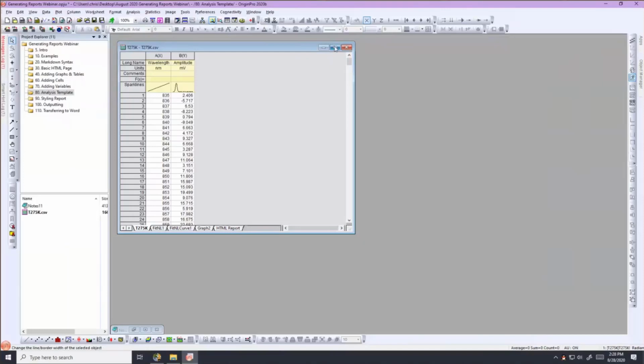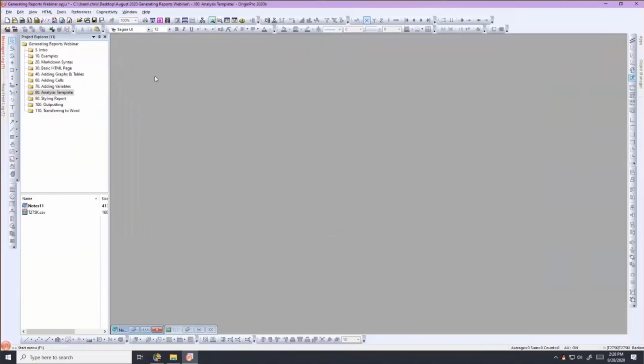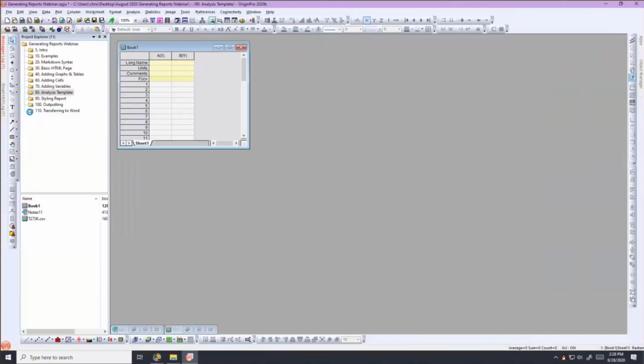So maybe a week later, we get some data files we generated. We'll come in and choose File. I need to actually activate a workbook for the menu to show up properly. We'll choose File, Batch Processing, and then our batch processing dialog will show up here in just a minute.